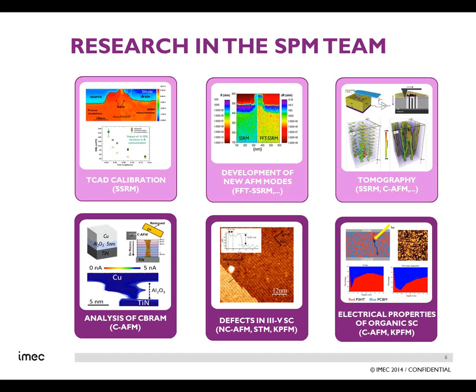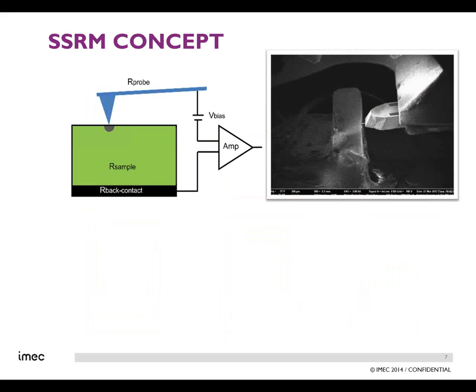But our central research field in this team has been linked to one of these techniques in particular that we have invented here on site, and that we have also developed for more than 15 years now, which is the scanning spreading resistance microscopy. So most of my talk will be focusing on this technique, even if I will also show you a few results with different ones. So what is this technique is the first question.